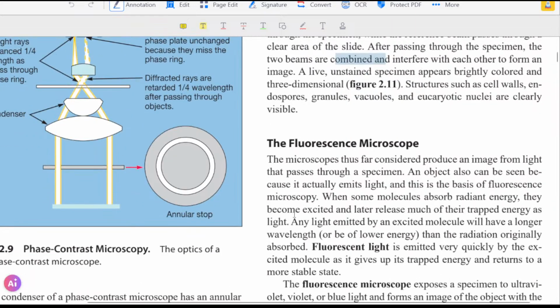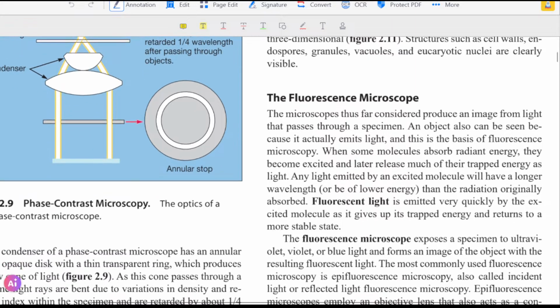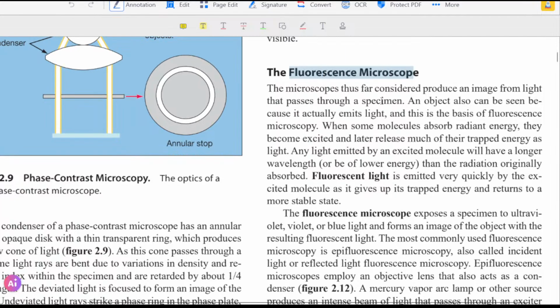Right? Guys, the more we go deeper, the more we will find, and I don't think we need to go inside that. We'll do some casual live and study how our eyes can see the light, right? So the fluorescence microscope. This is another, wait, what did I say just now? The fluorescence microscope, and by name it shows that there will be some fluorescence used in the microscope. Like for the previous one, it was just the shadow, it was just the image, right? Just the image.